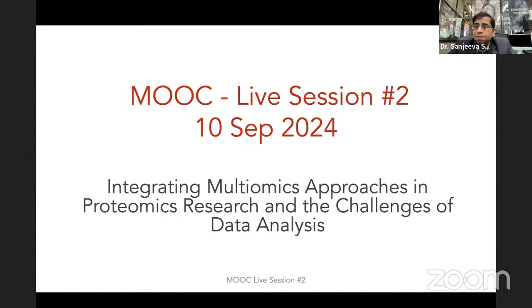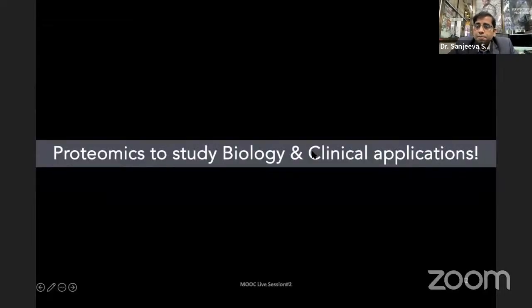In this particular session, we are going to show you some live experiments from different types of proteomics and genomic technologies. But more focus will be on how to do the data analysis and integrate data from proteomics and genomics. So rather than making it very theoretical, I thought to keep it very minimal in terms of talking to you on the slides, but we do more hands-on in the lab. But I'll give you a very quick flavor of where proteomics has started making more impact to understand biology and addressing many clinical questions, right?